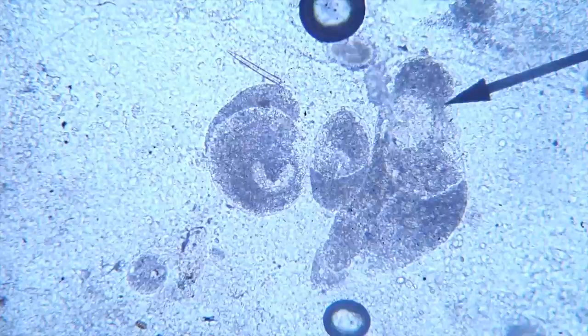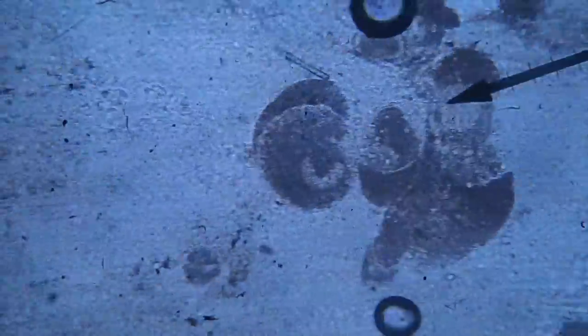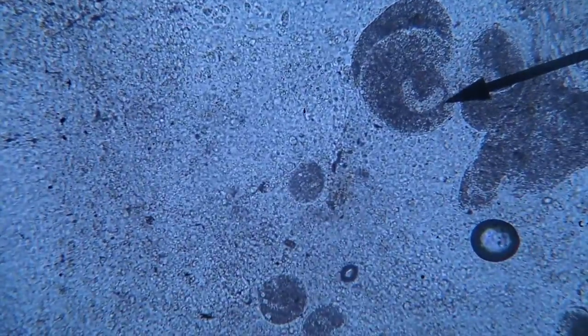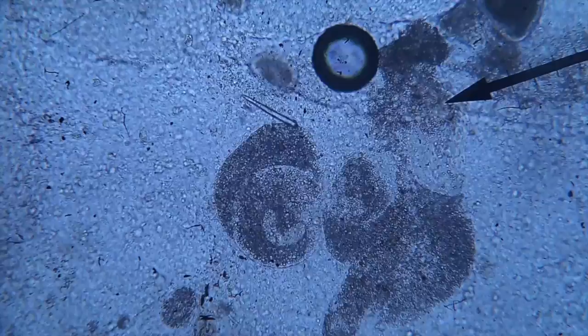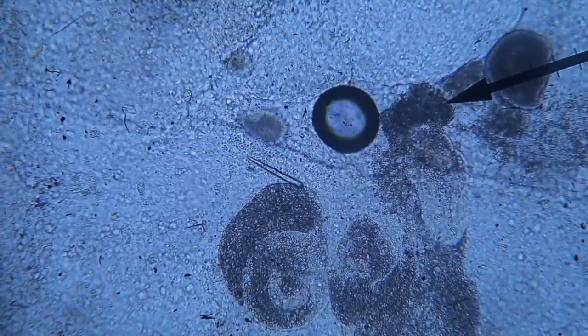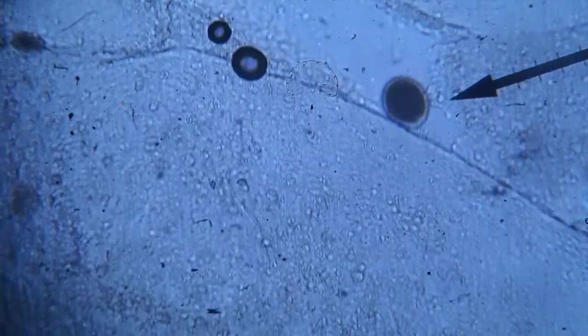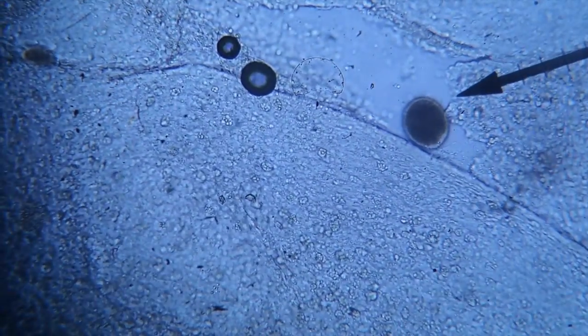Here's a skin scraping showing white spot disease. Freshwater white spot will have this horseshoe-shaped nucleus, as you can see here. This is at 100x magnification. Normally you can see white spots with the naked eye, but here you can see the intricacies of the parasites. The smaller versions of white spot disease move around and graze on the fish skin and mucus, causing intense irritation.